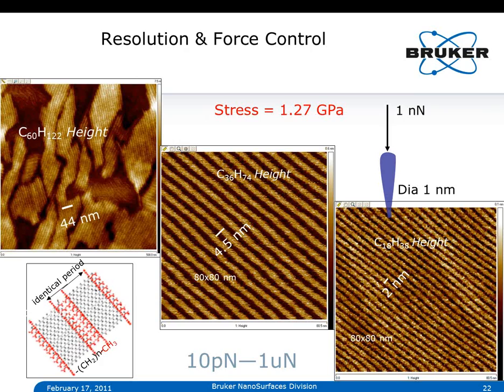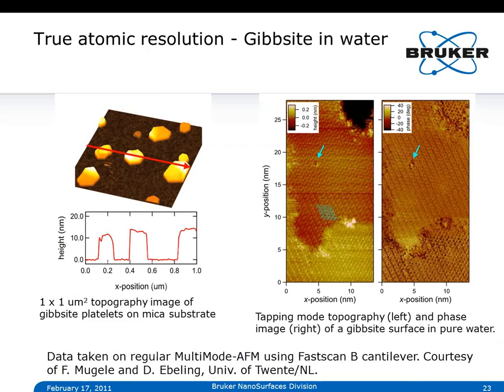However, tapping mode is extremely useful and shows, of course, great strides still when you use it in fluids. And in fluids, a lot of the effects we talked about are eliminated. And I show you some absolutely stunning data here, obtained in fluids in the group of Frieda Mugele, together with Mr. Ebeling at the University of Twente in the Netherlands. And they imaged on just a regular multimode with a regular fluid cell, clay-like materials, and Gibbsite is one of these.